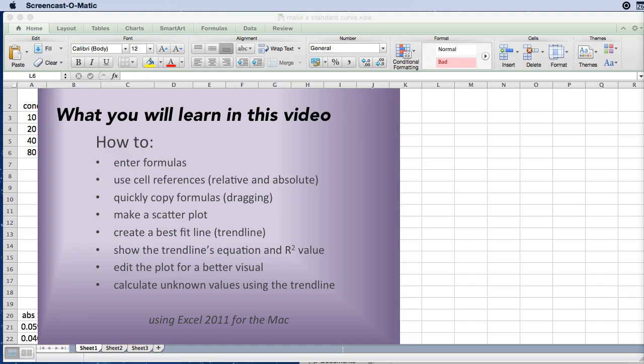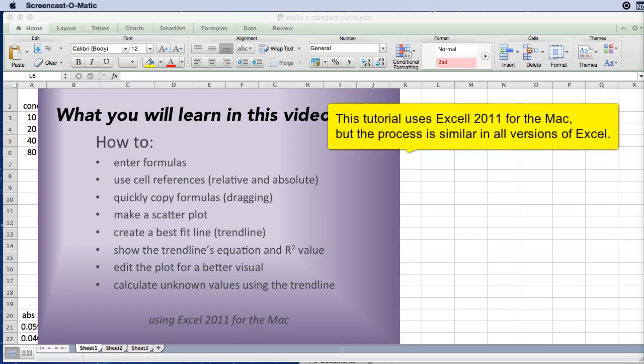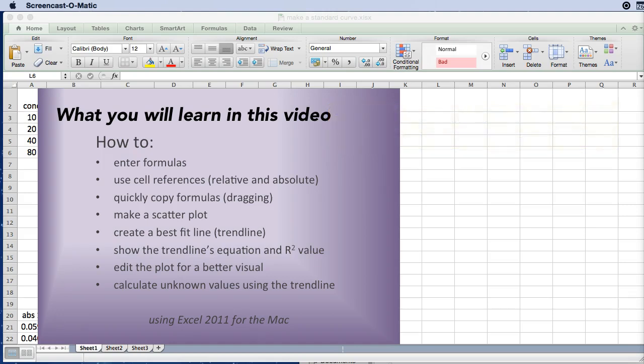For example, a protein concentration or maybe an enzyme activity. You will also learn several useful tools when you are using Excel to make your graphs.